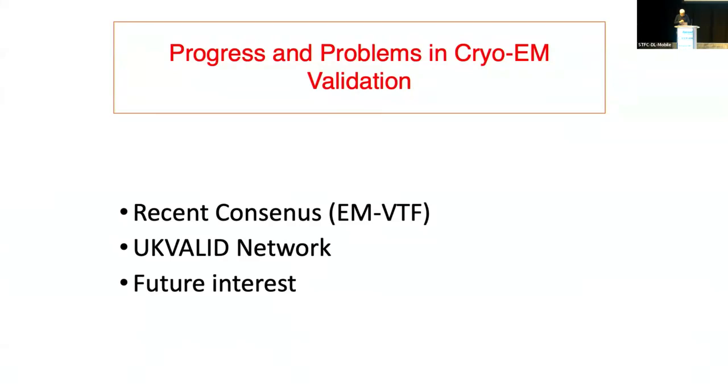And in fact, I was encouraged to speak on some of the recent community results from the electron microscopy validation task force. So community agreement already might represent some form of progress. Then I'm going to talk a little bit about outputs of the UK validation network, and then we'll move on to some subjects of future interest.